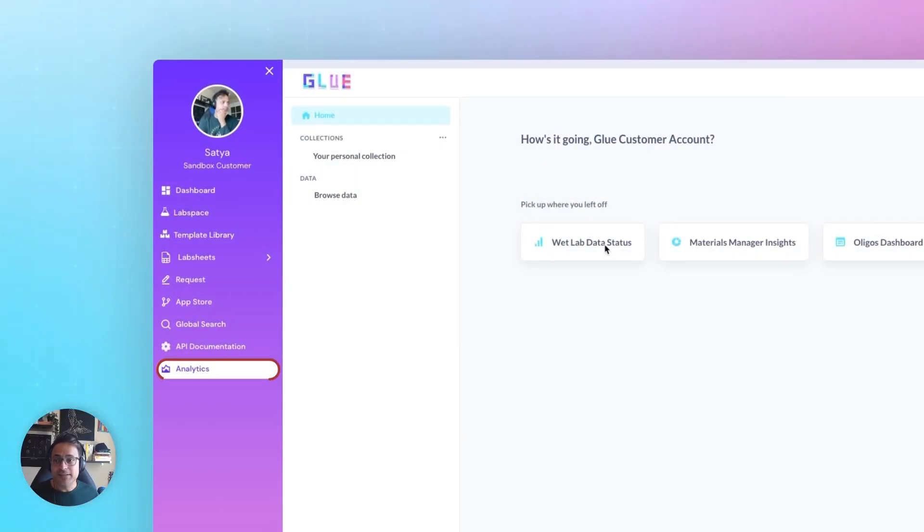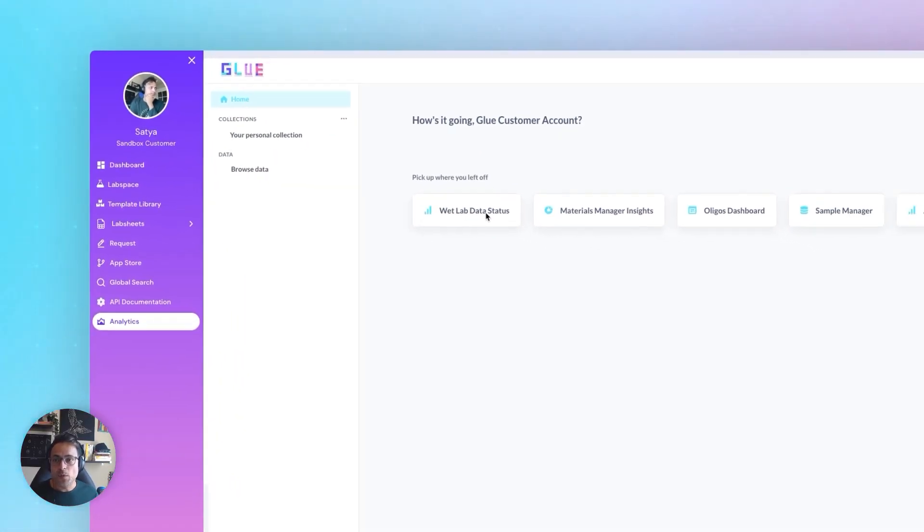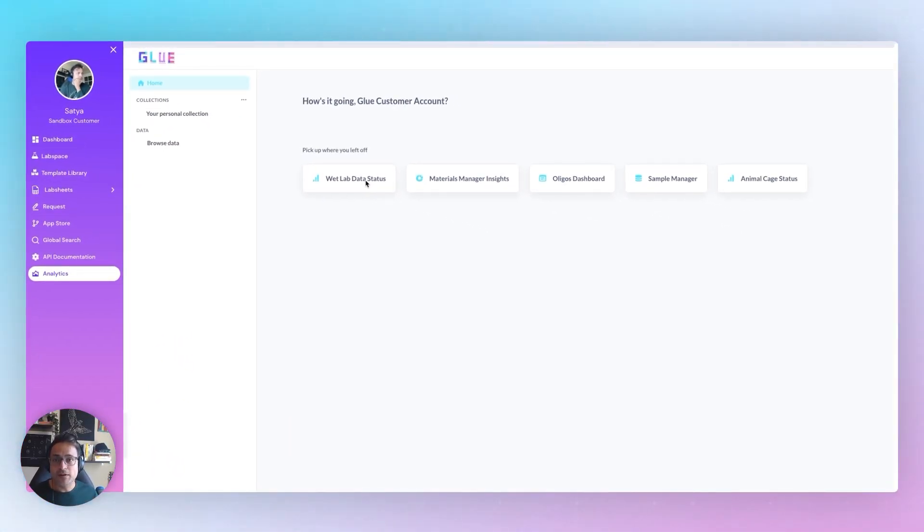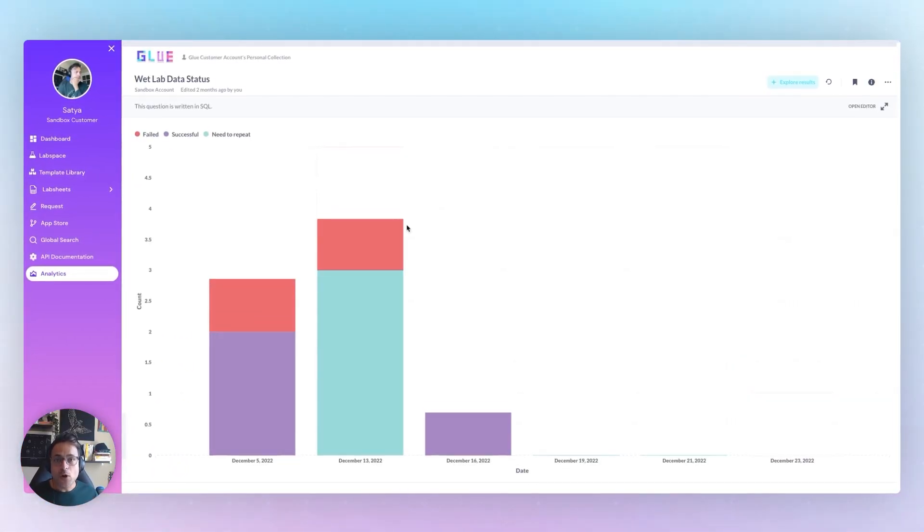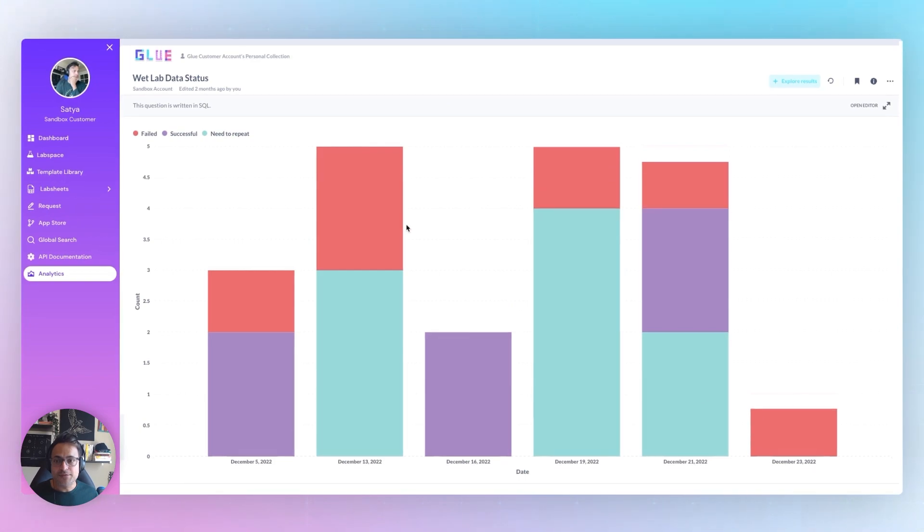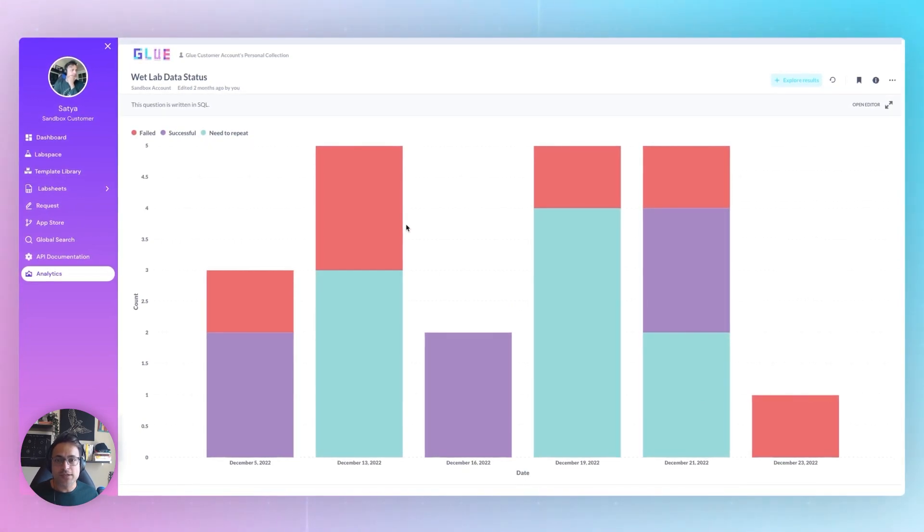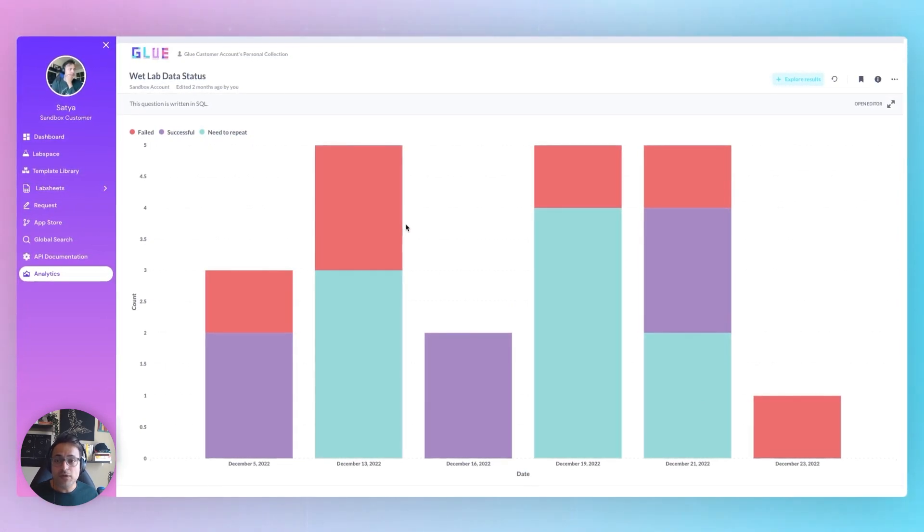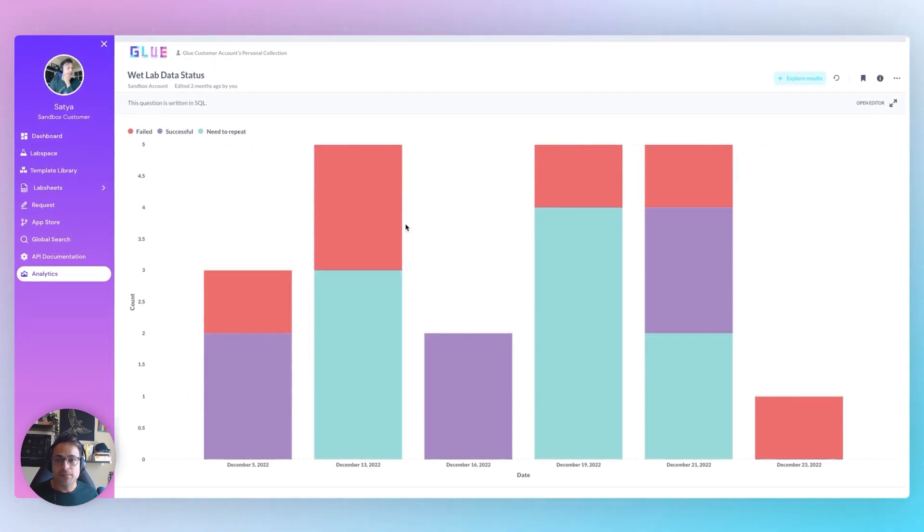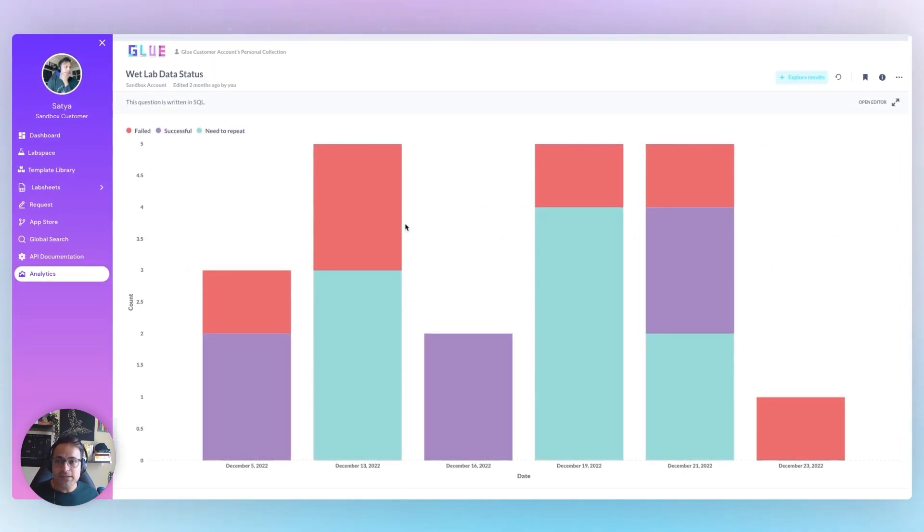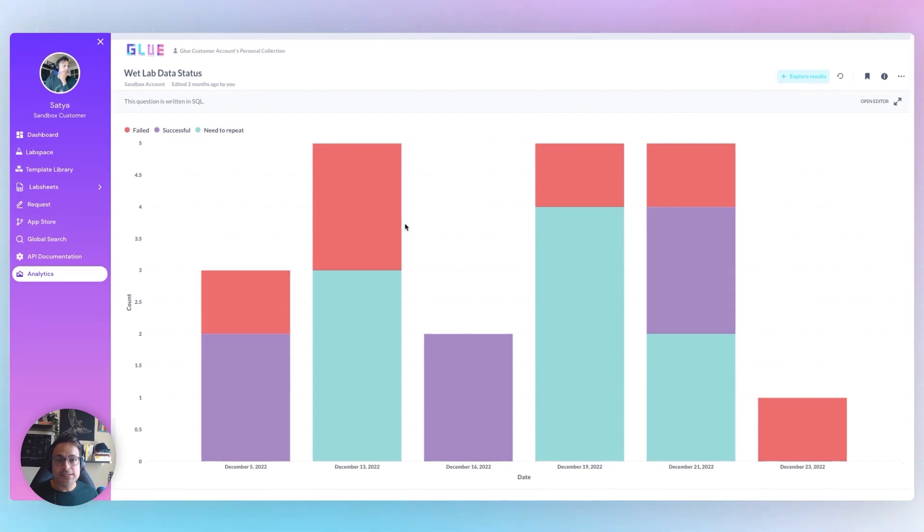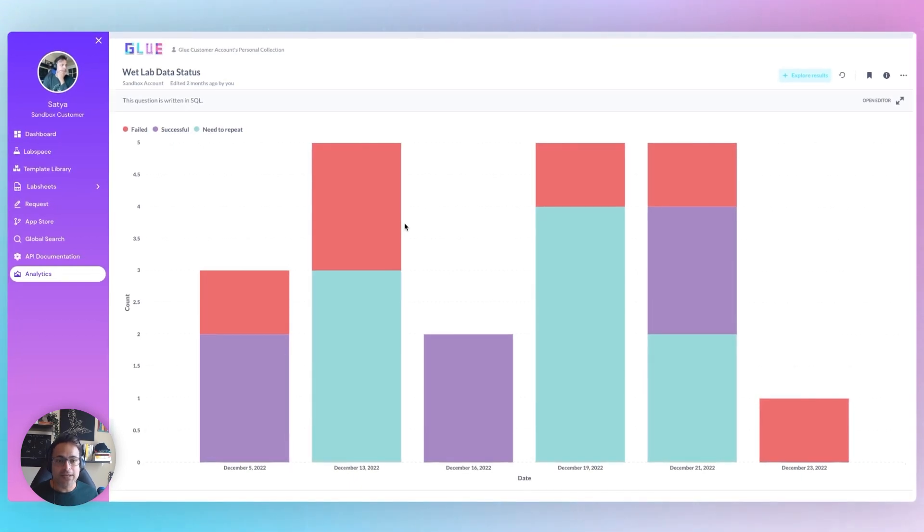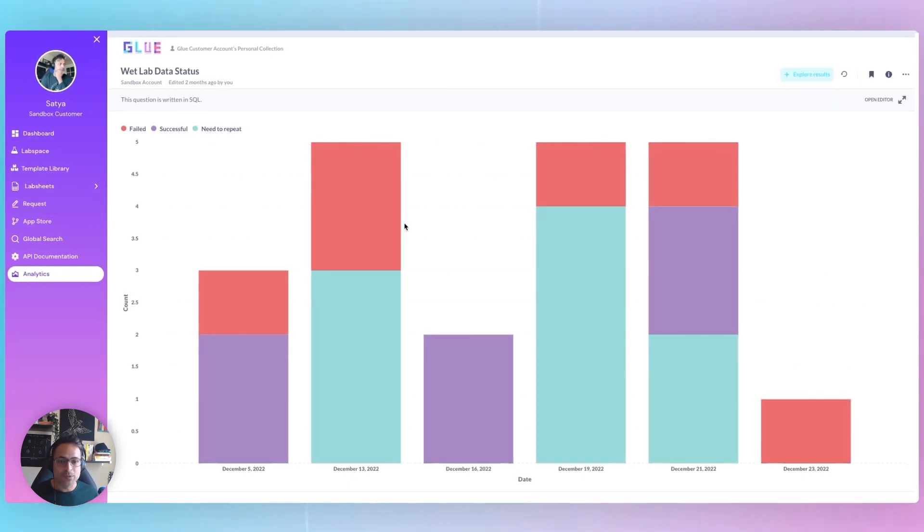And finally, there's analytics, where you can prepare graphs on the data that you have saved within SciSpot without leaving the platform. And you can bring these graphs inside your dynamic lab spaces as well.